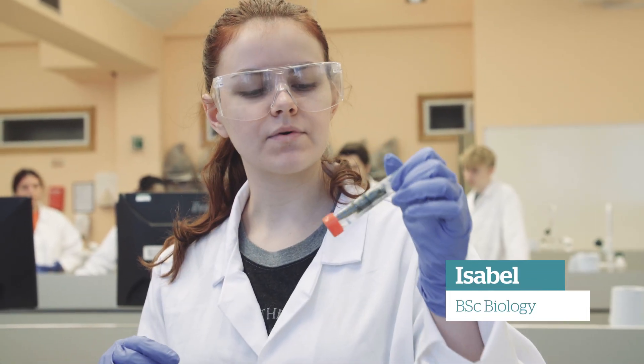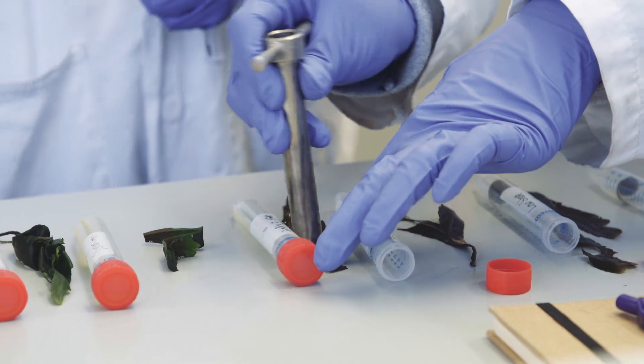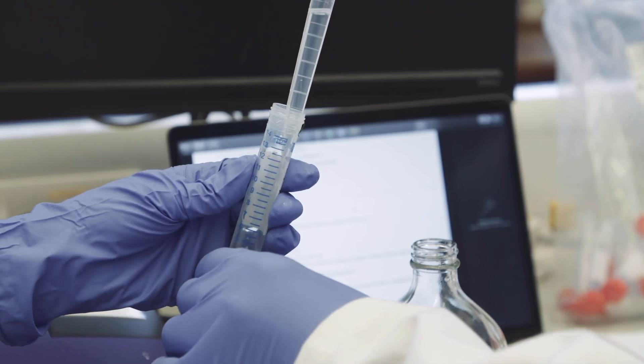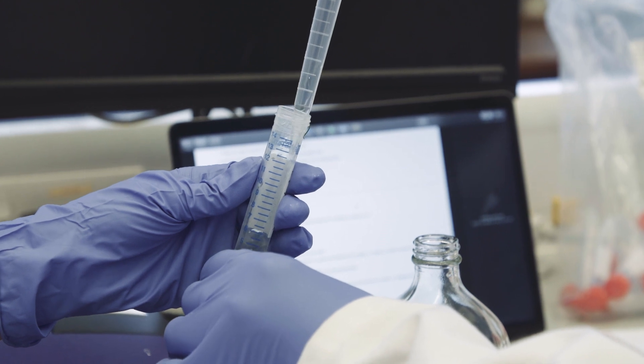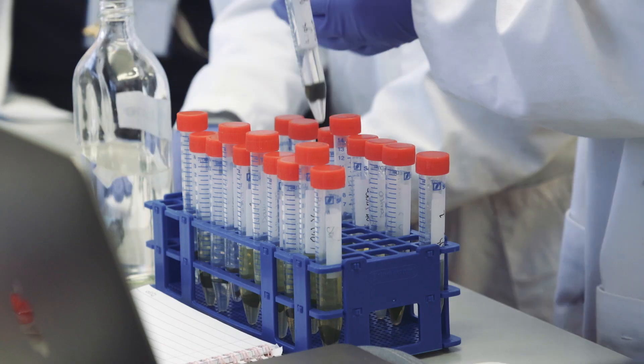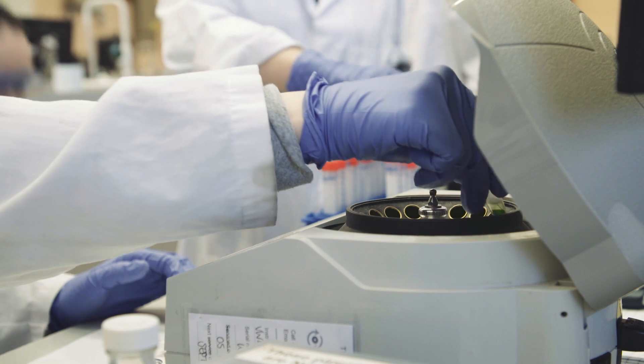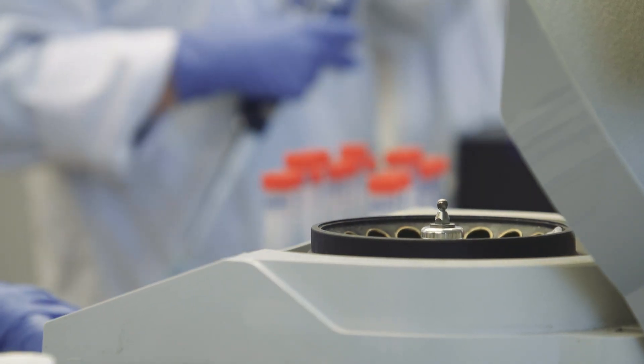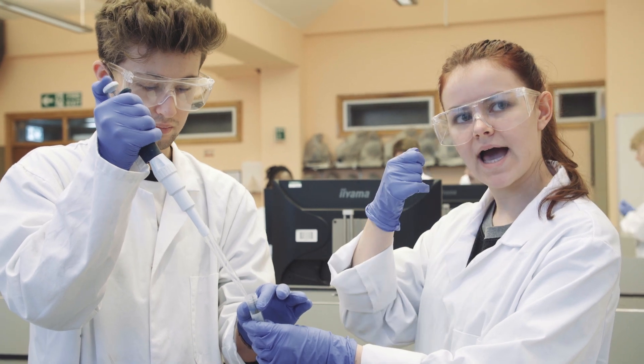We're adding acetone to the seaweed samples so it will break down the membranes and the pigments will come out. When we put it into the centrifuge, all the pigment should separate and the chlorophyll should be on its own compared to the rest of it, so then we can pipette it out.